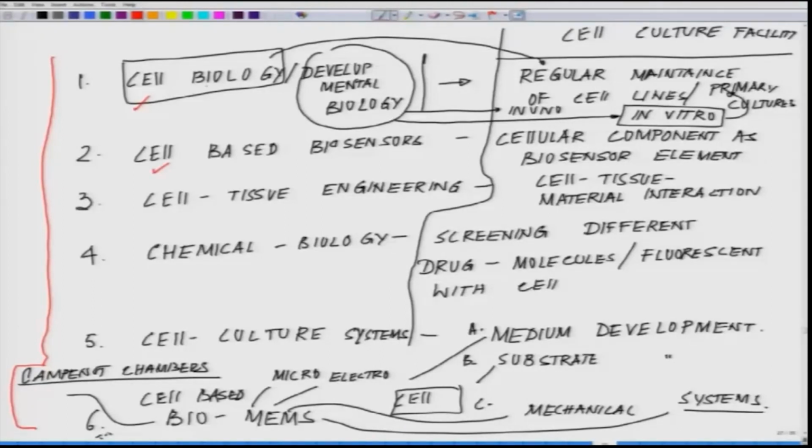So, now I add few more points. Are you working on, say, now I am adding few other points out here. Say 1A is this, then are you working on infectious biology? Are you working on virology? Infectious biology, virology. So, that brings us to the point of level of biosafety. The contrary, if you are using a kind of regular cell lines, it really doesn't matter. I mean, nobody really bothers. I mean, it's perfectly fine. Or you're using some kind of straightforward materials directly derived from biological system, should not be a problem.